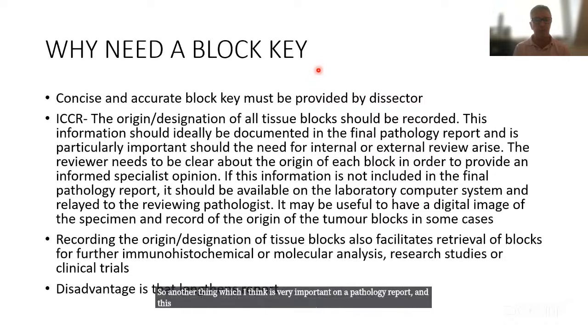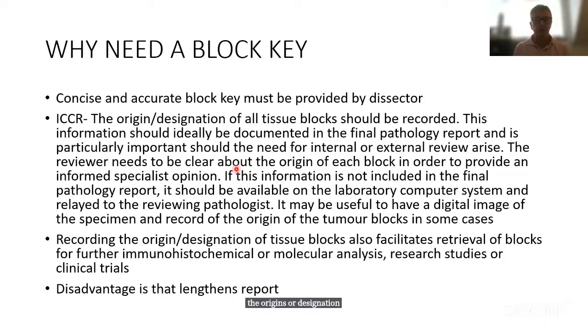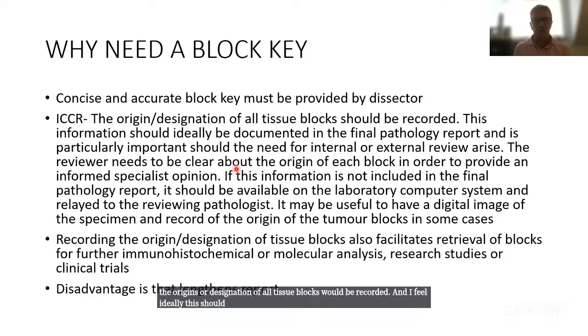Another thing which I think is very important on a pathology report, and this comes from the specimen dissector, we do need a block key. We need a concise and accurate block key. This is just from the ICCR data set. I'll talk about the ICCR in a minute. It says the origins or designation of all tissue blocks should be recorded. And I feel ideally this should be documented on the pathology report.